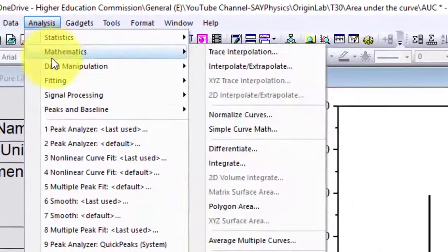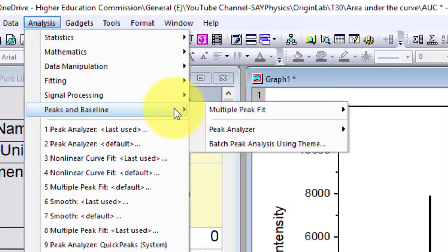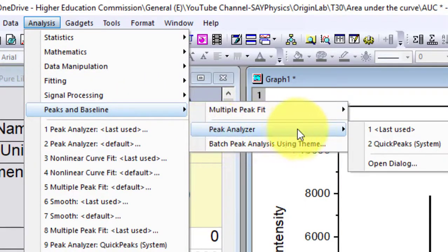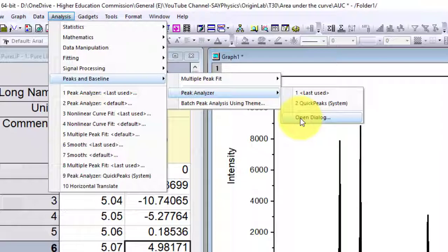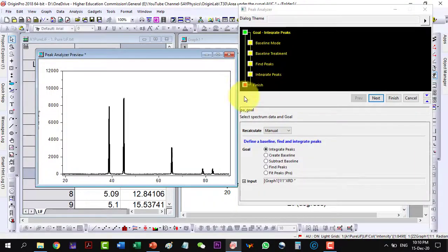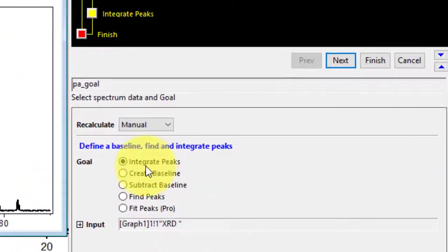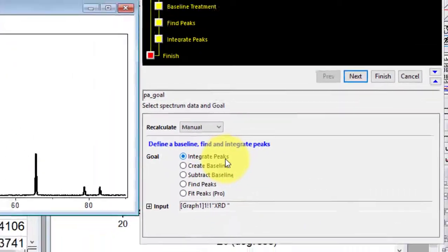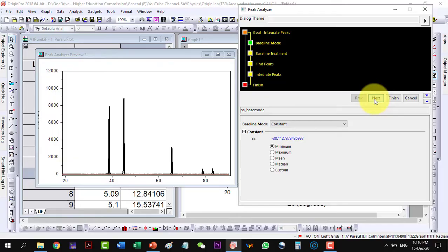Analysis, and then Peaks and Baseline, and to the Peak Analyzer, and I will open the dialog. As I open the dialog, then a preview opens here which will give me indications as I go on with this menu. Now I am doing the Integrate Peaks, so I will click Next. And here, the baseline mode, so the red line is shown here. It is the baseline.